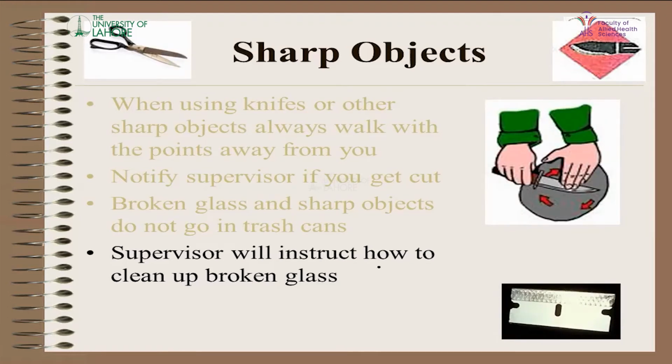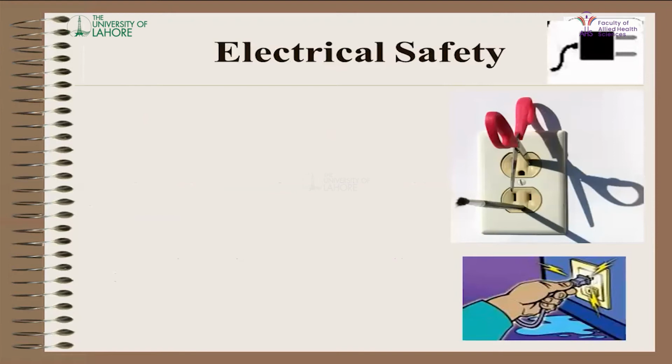If you want to dispose of waste, always use a biohazard sign labeled sharp box, and try to use it one way, that is, syringes, needles and blades are put in the sharp bag or sharp hard container once, and you fill it three-quarters of the container, and you never reopen it. Only close the container and properly label it, and you can dispose of the hard container.